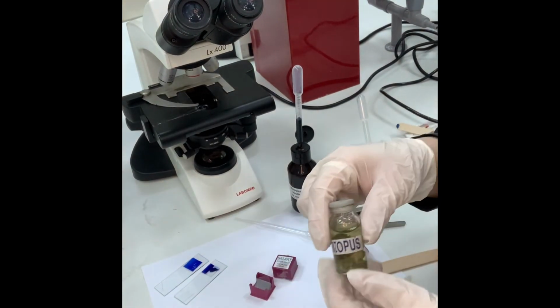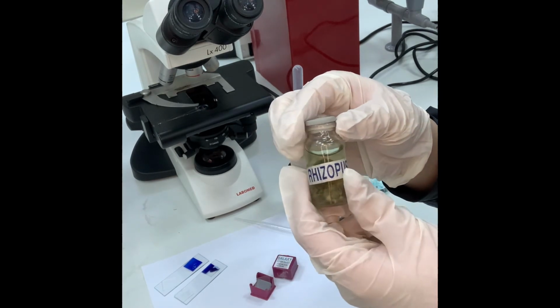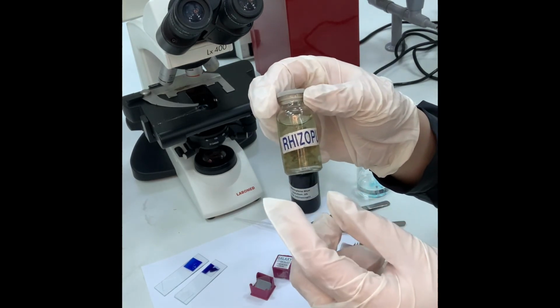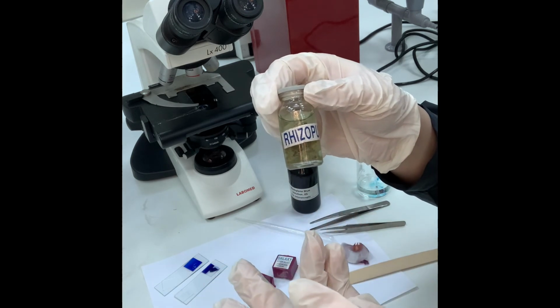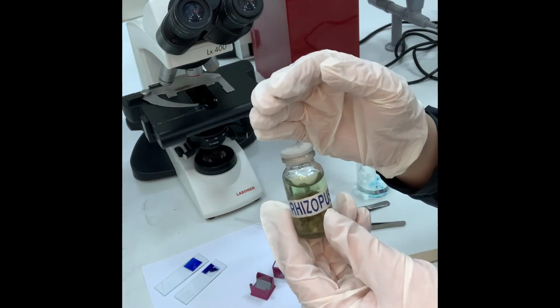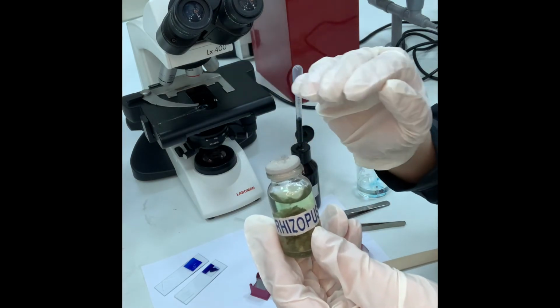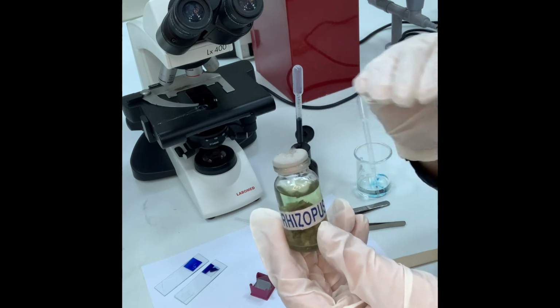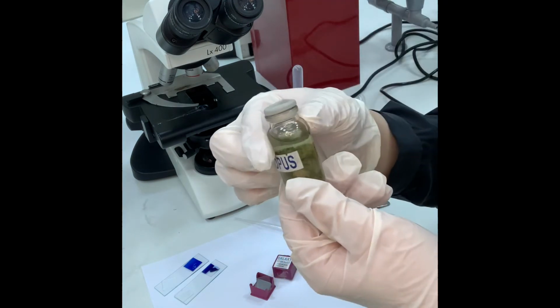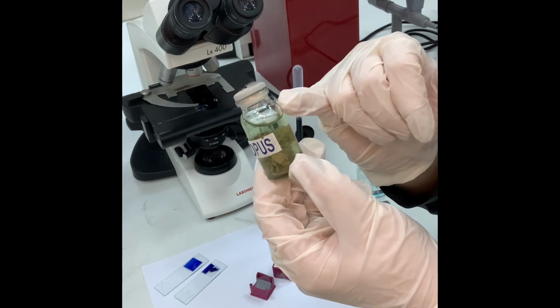Now, to prepare a fungus sample, this is Rhizopus. It is a black mold fungus, bread black mold. Remember, if you ever experienced black mold on top of bread, we removed that bread and added it in a preservative. This is alcohol.